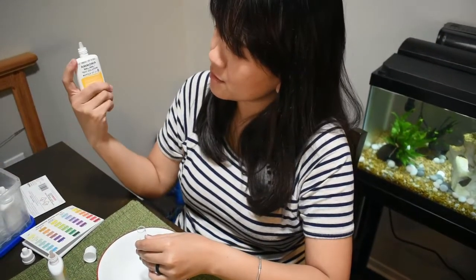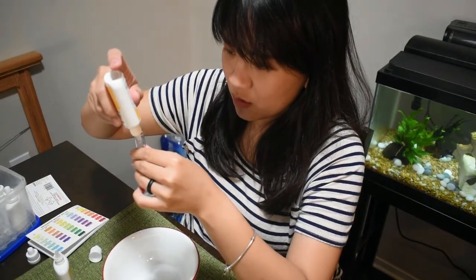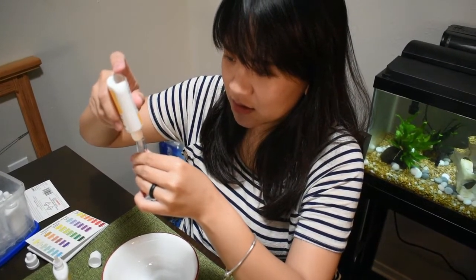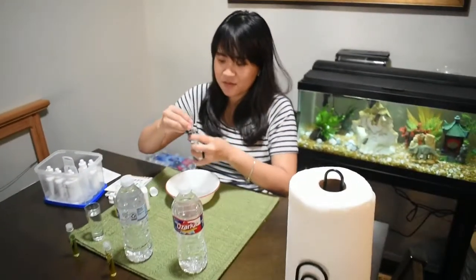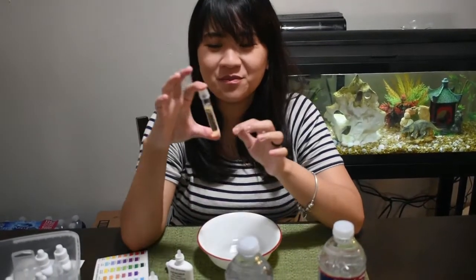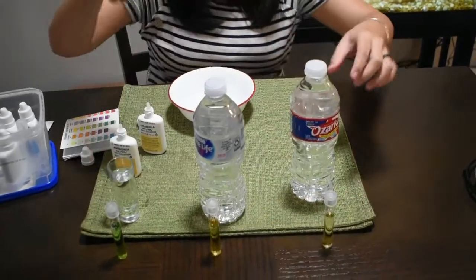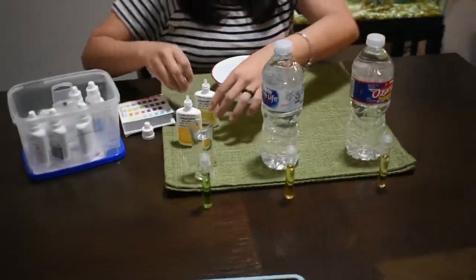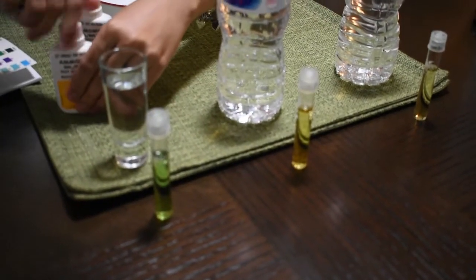Second one. Ta-da! This is the last one. 1 2 3 4 5. That's it. We kind of wait now, and I will show you how to read the test result from the color and stuff.